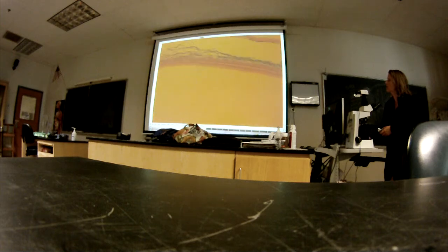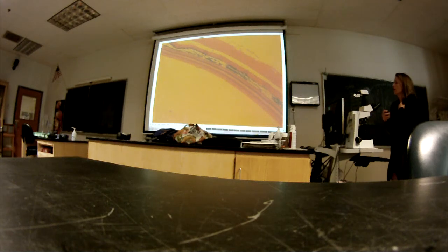Okay, and it goes back to that kind of a mess over there. Here it's a little better. See, so you follow it all the way from the ciliary body. Now it looks like your more typical looking choroid, the dark on the sides. And it has lots of blood vessels. That's why it's called the vascular tunic. Any questions? Any other parts you want to see or that I missed?